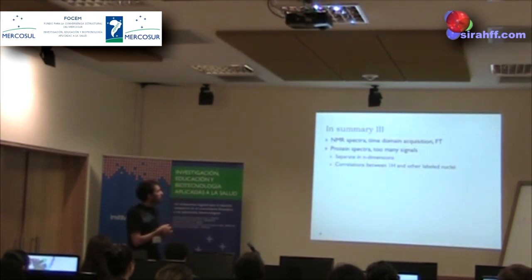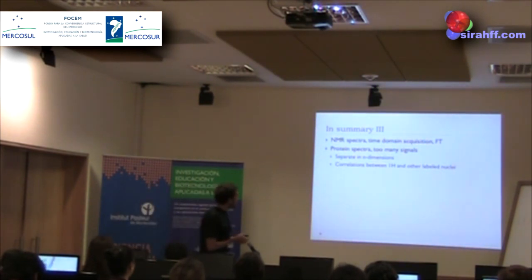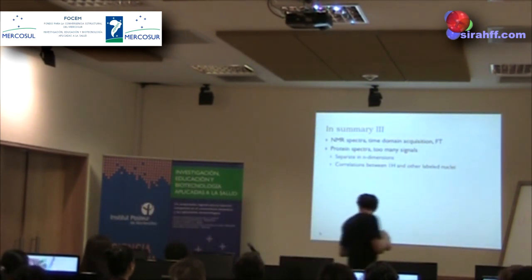So, to summarize this third part, for acquiring NMR spectra, we acquire time domain data and then we transform. And in protein spectra, we have way too many signals.